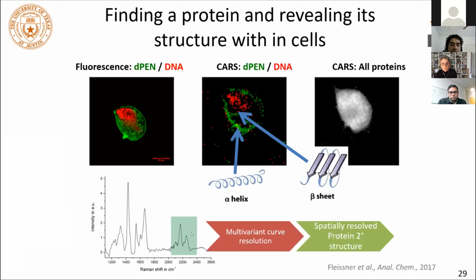Yeah, I asked early in the chat because I didn't wait long enough, since you then showed quite a bit of the work, when the question was which other molecules can be imaged. You showed DNA, fibrin, lots of lipids, and lots of other things are coming along now. So I think you showed excellent examples.